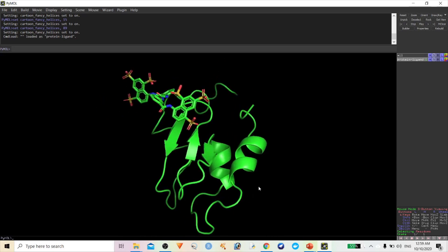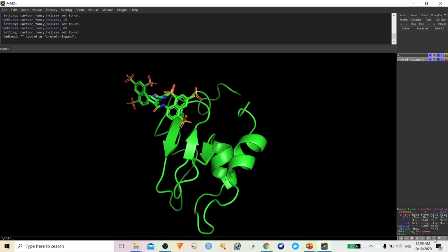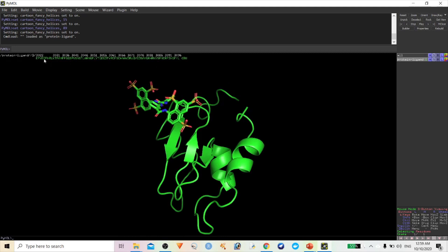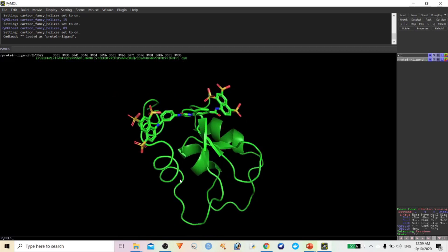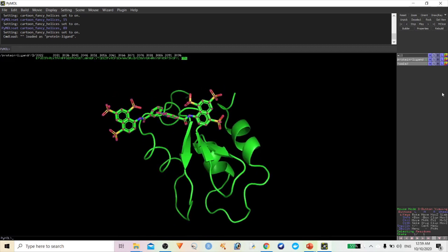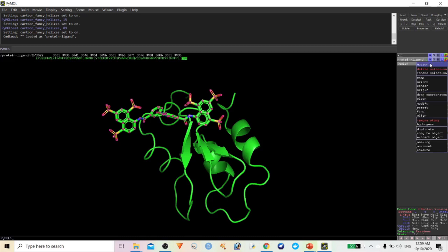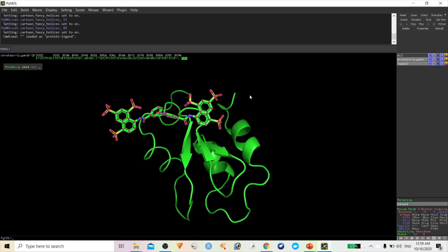Here you can see the docking complex of protein and ligand molecule. To check the interaction of this ligand, you first have to select the sequence. If you click on sequence, it will display your sequence in single letter code, and at the end of the sequence you will find the ligand molecule or drug compound. If you select this, a menu will pop out and you have to rename this selection into a separate tab. Click on Action and rename the selection as 'drug'.